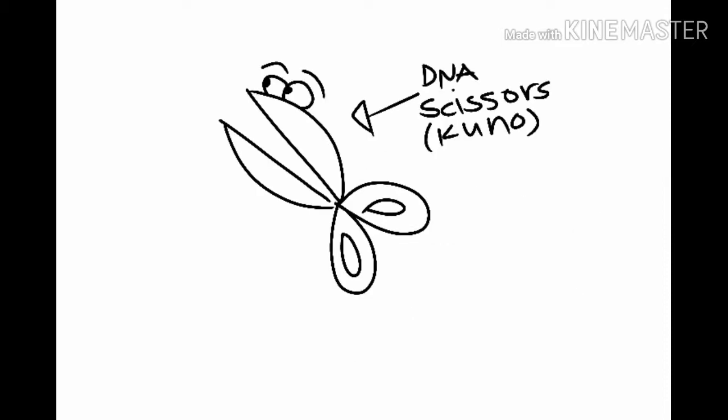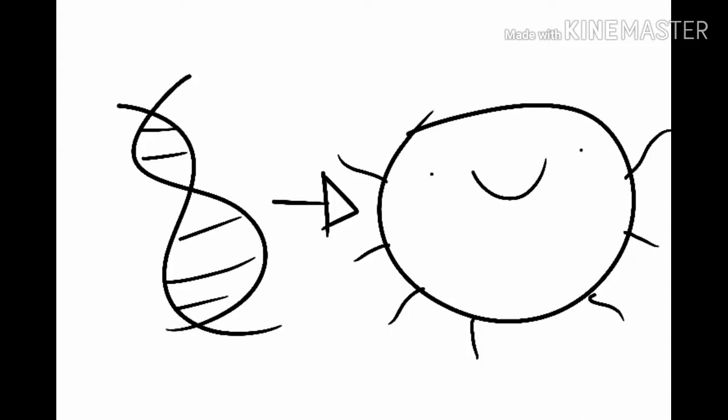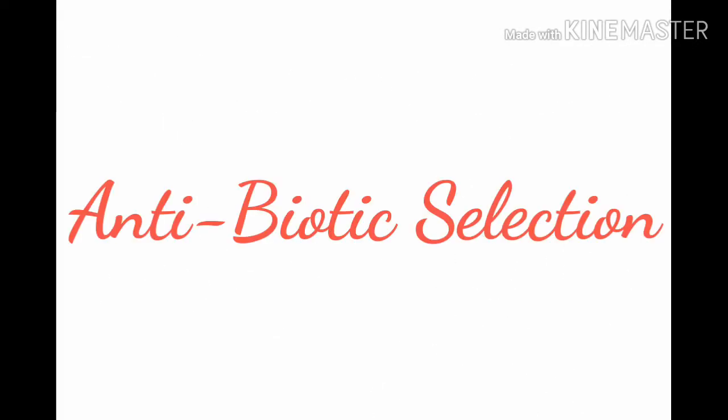This step uses restriction enzymes and DNA ligase and is called a ligation. After a ligation, the next step is to transfer the DNA into bacteria in a process called transformation. Then, we can use antibiotic selection and DNA analysis methods to identify bacteria that contain the plasmid we're looking for. Steps of bacterial transformation and selection.